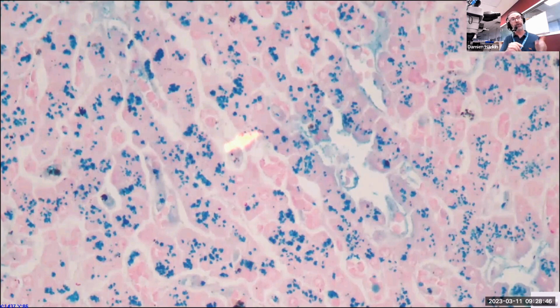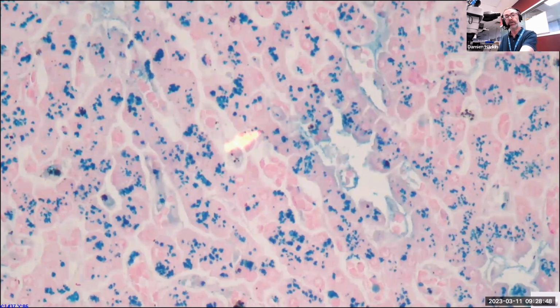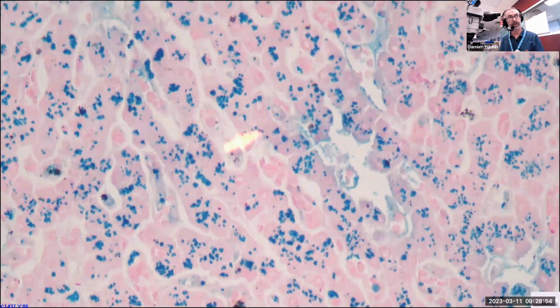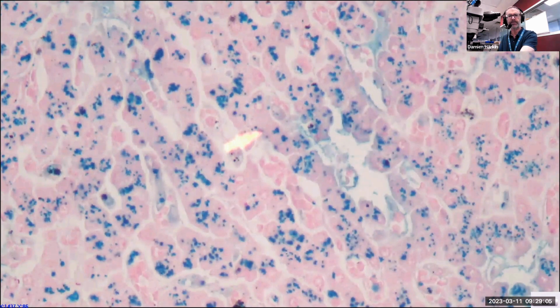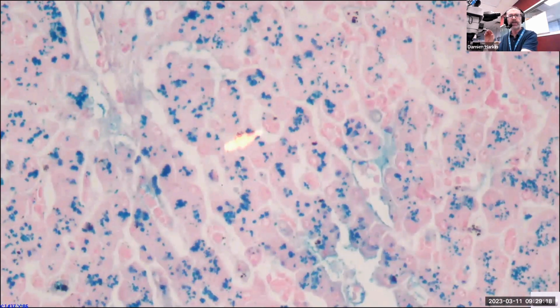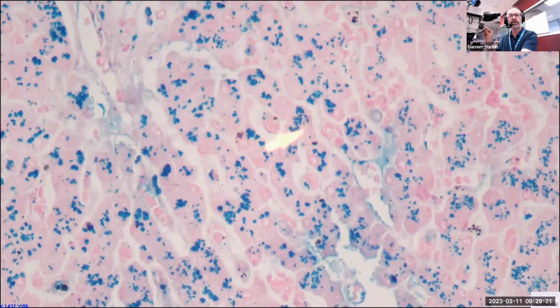So this is ferric ferrocyanide, whereas Turnbull's blue was ferrous ferricyanide. So it's simply a change in those oxidation states, but when they all combine, we get what appears to be a fairly similar blue color. I tend to think the Prussian blue looks a little bit more vibrant than the Turnbull blue. But in any case, it's a really lovely stain. And of course, you can probably pick out what the counterstain is here. Again, it's using nuclear fast red just to provide that really nice complementary color.